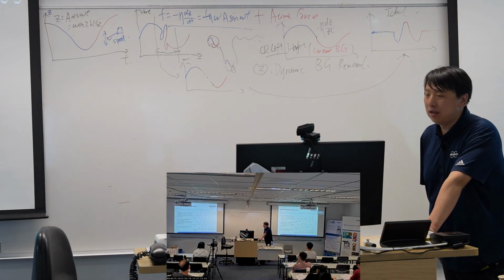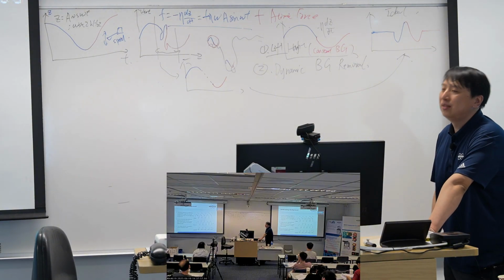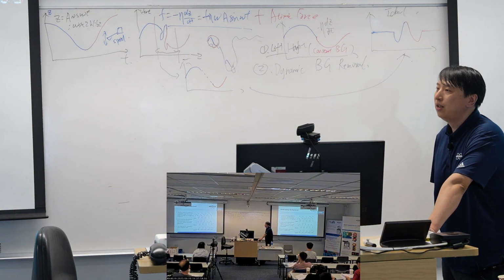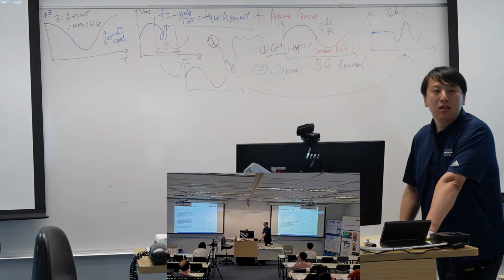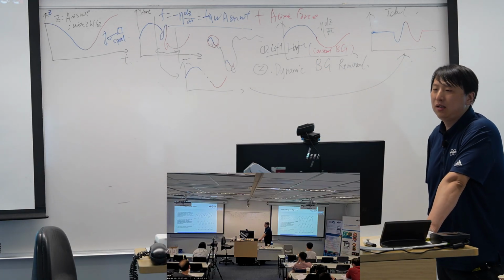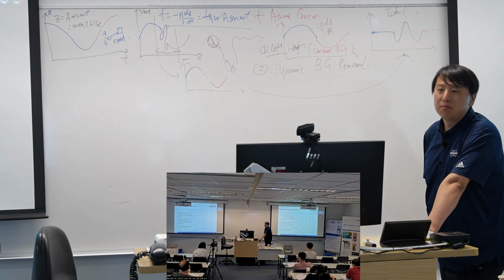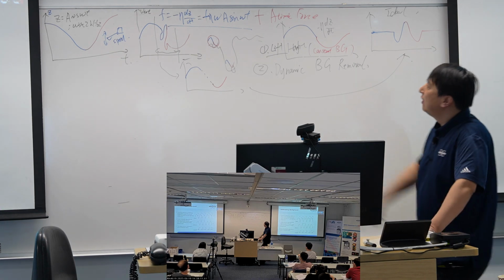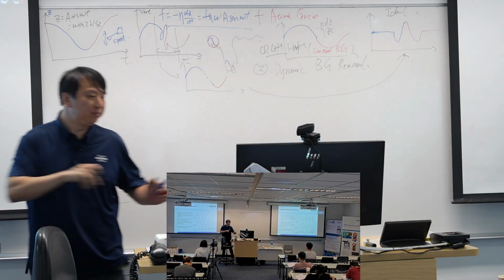And I myself think this is quite a smart way, and it may work better than the lift mechanism, especially for those peaky or valley samples. Okay, so this is about background removal.